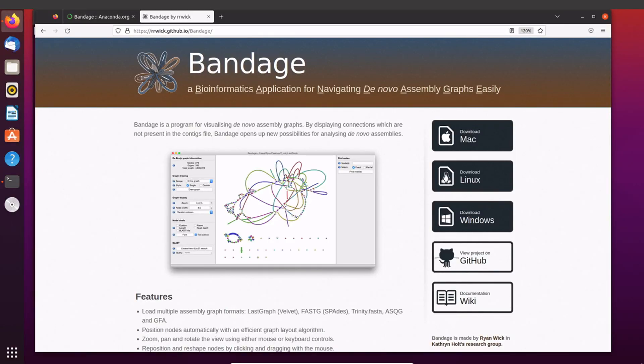In this tutorial I am going to show you how you can install Bandage using conda. For those who don't know, Bandage is a tool that is used for visualizing the de novo assembly graphs. You can use Bandage to identify complete genomes, short sequences, repetitions, etc. Basically you can use Bandage as a quality control tool for genome assemblies.